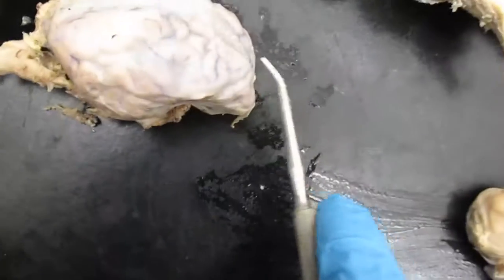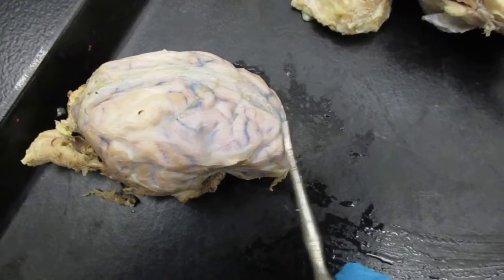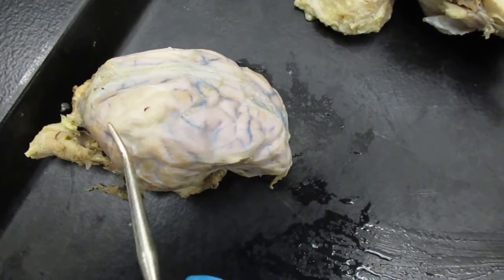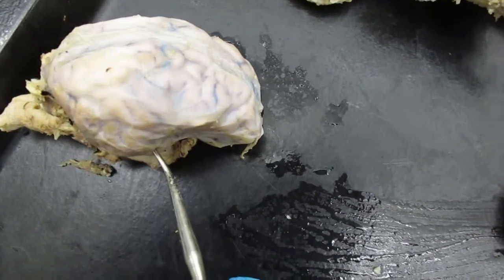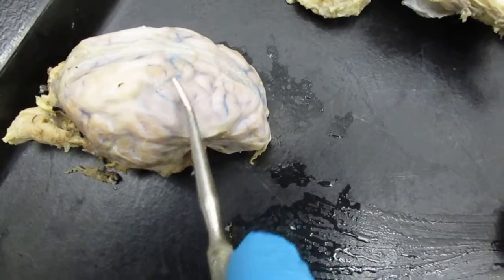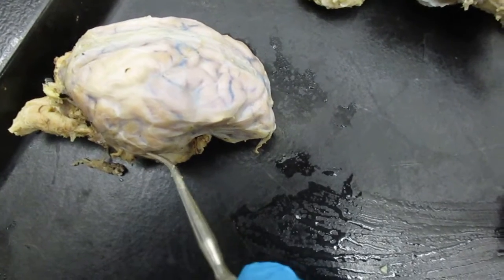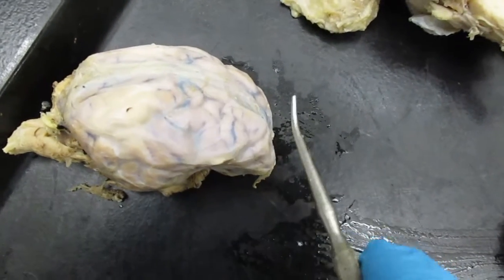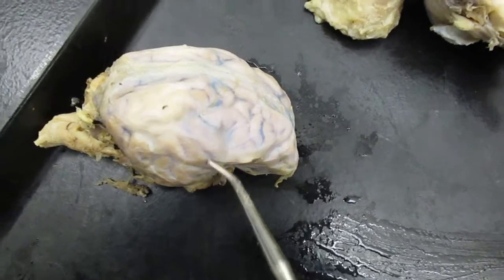And then you have your frontal lobe, parietal lobe, occipital lobe, temporal lobe right here. Frontal, parietal, occipital, temporal.